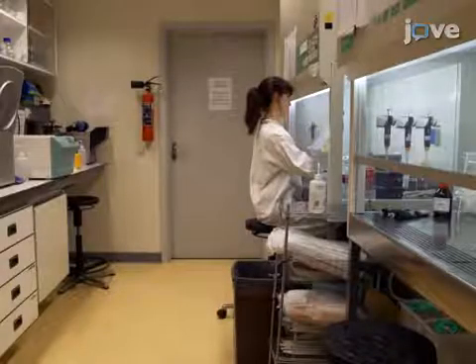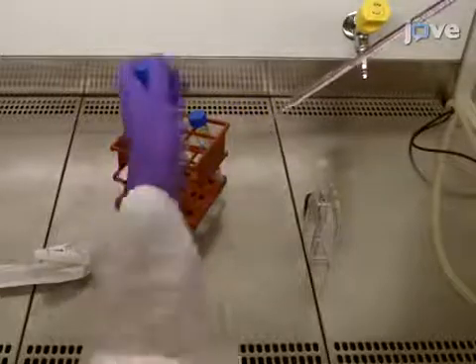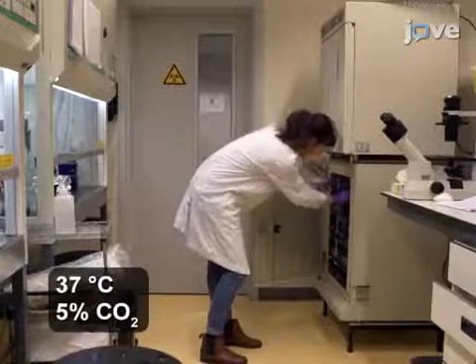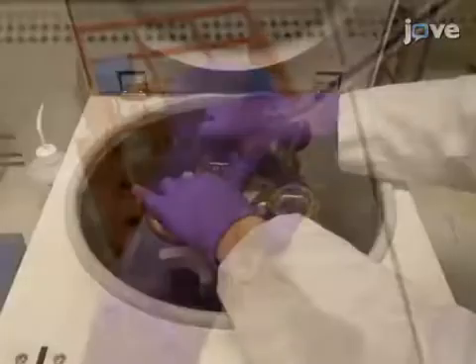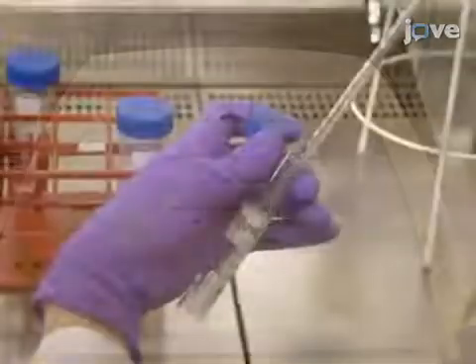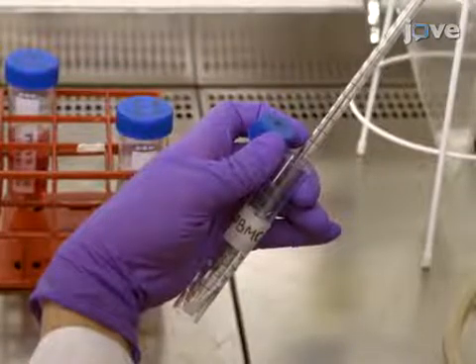Before staining the PBMCs, plate them in a 25 cm flask with 6 ml of complete RPMI 1640 medium and let them recover overnight. After blocking and washing the cells, collect the PBMCs in a tube with a half milliliter of medium and spin them down. Then resuspend the cells in labeling buffer and count them.